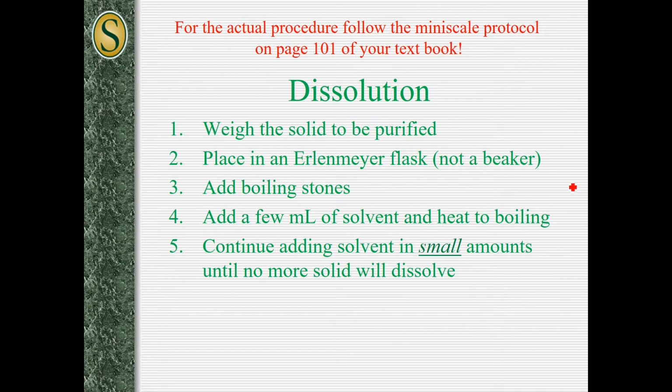The process, like I said, involves you weighing the solid. So you weigh the solid and drop it into an Erlenmeyer flask. Okay, so that's your solid dropped into your flask. And then you add some boiling stones.